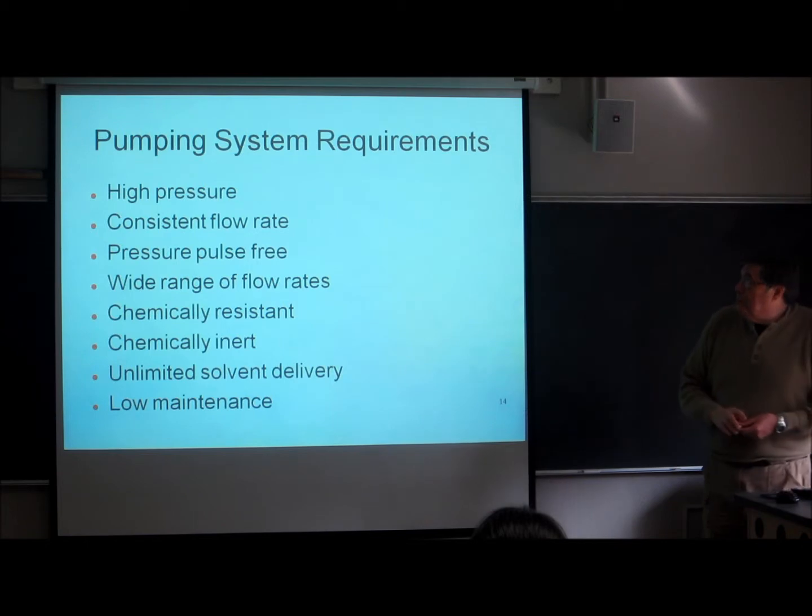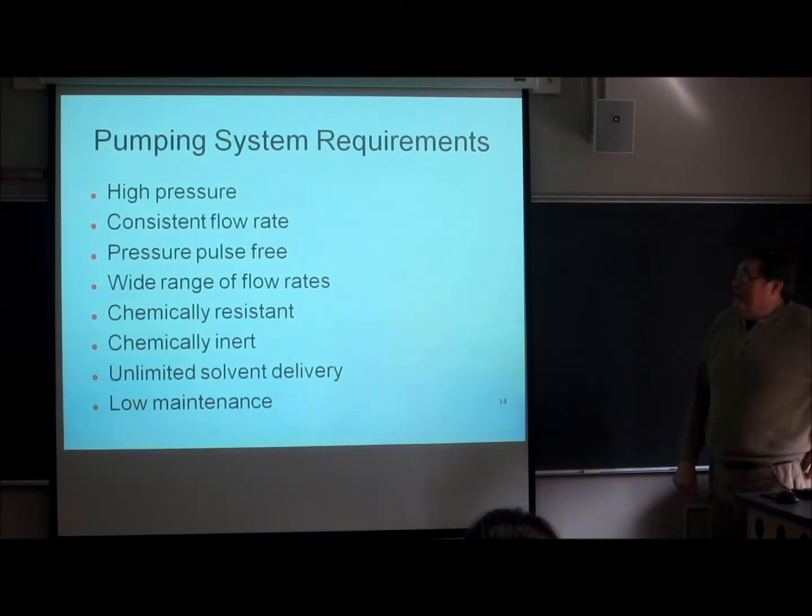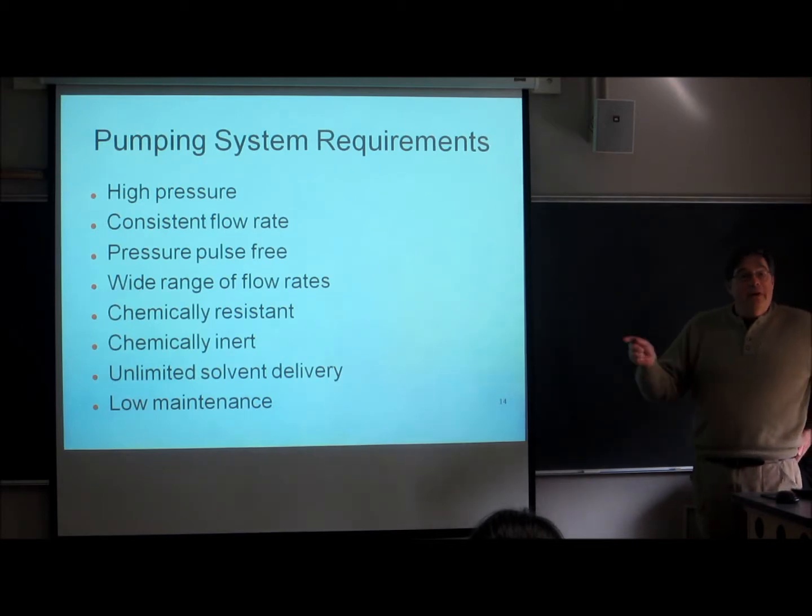So for good pumps, we need high pressure, because remember it's high performance LC, and it used to be called high pressure liquid chromatography, right? And then as Pete so often says, for a while it was called high price chromatography. And believe me, it's still high price chromatography. We need a consistent flow rate. The flow rate can't be pulsed.